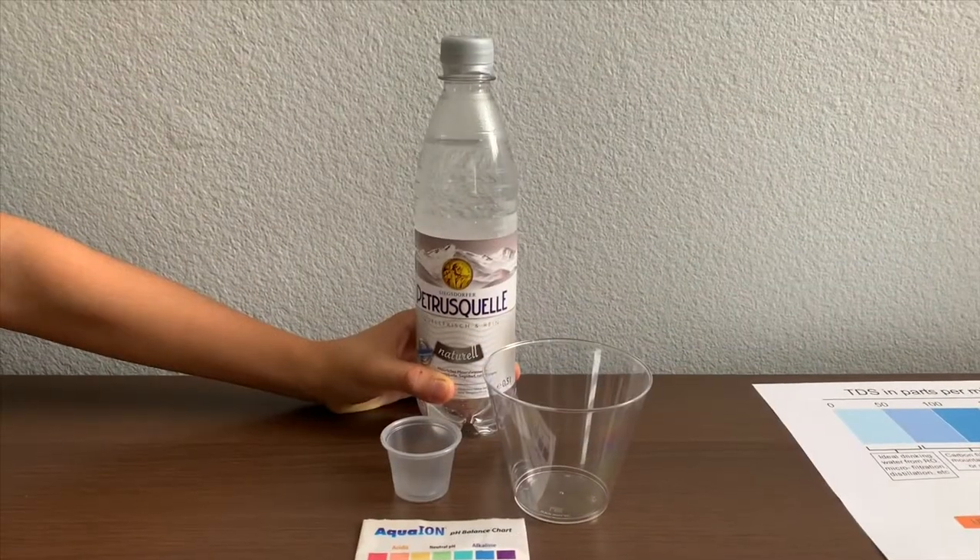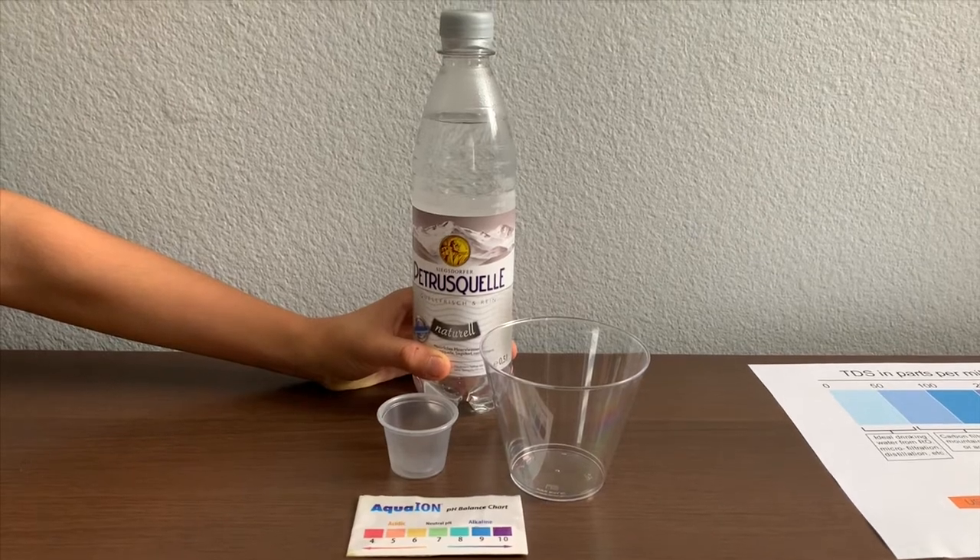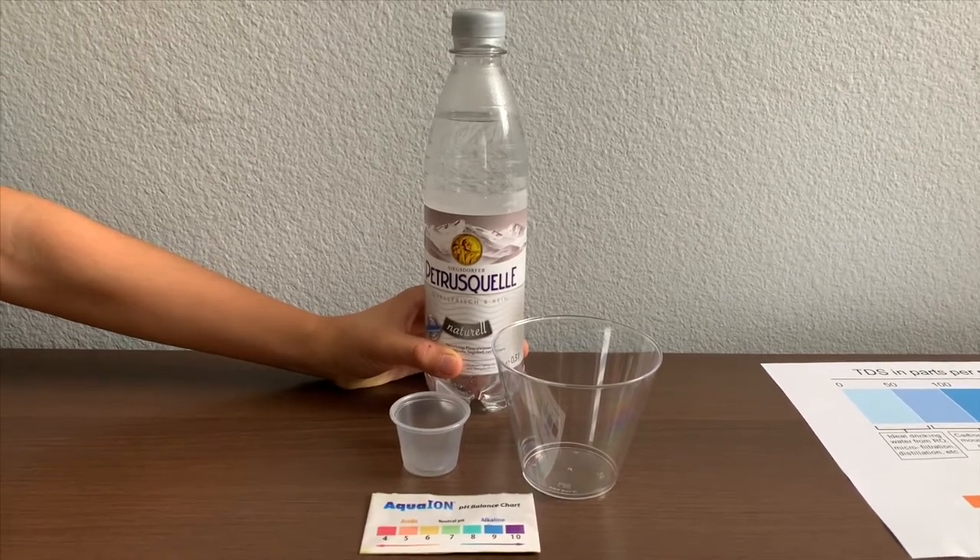This is Siegsdorfer Petrusquelle, natural and mineral water, sourced from Germany. Let's test the pH and TDS levels.